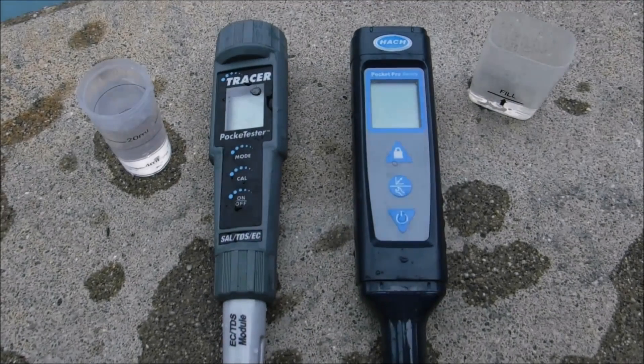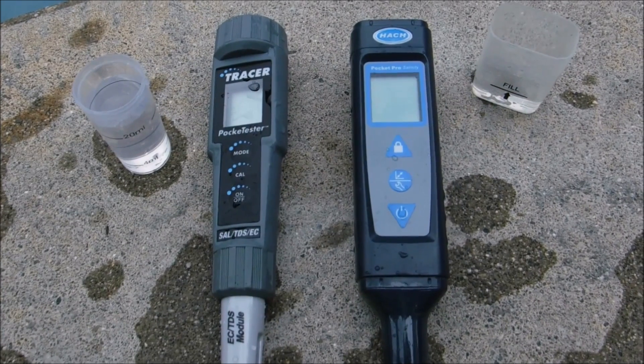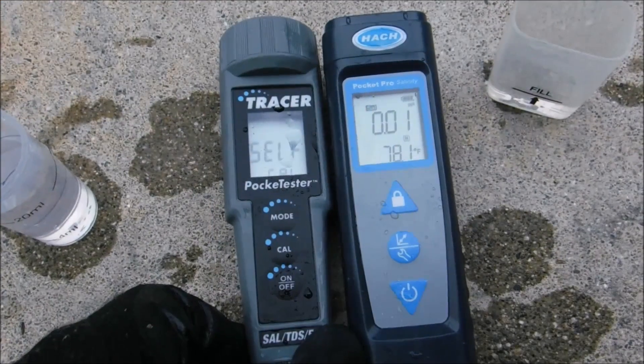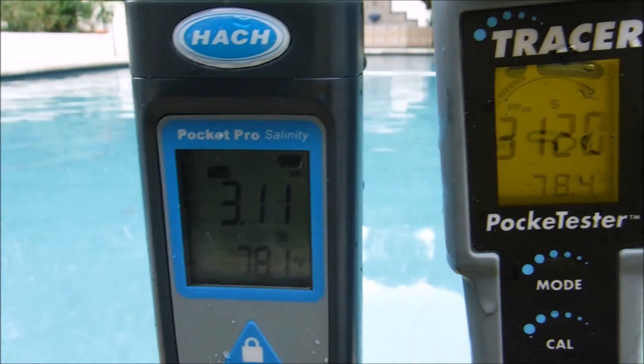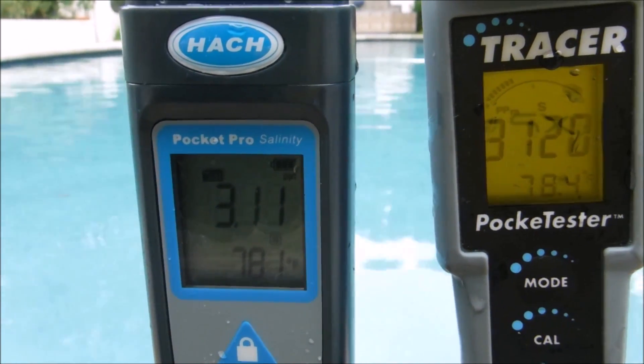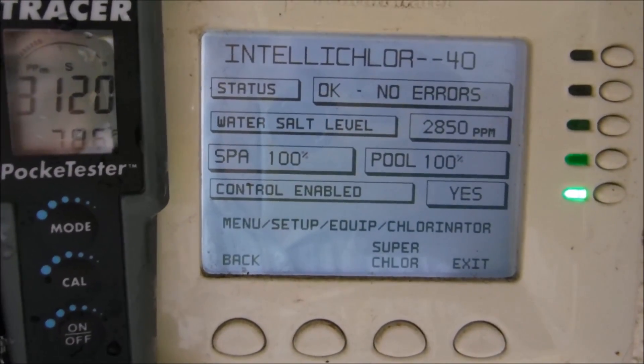I'm going to get the salt level at this pool with two different digital testers — the Tracer by LaMotte and the Pocket Pro by Hach — and let's see if these samples match up. Both meters are reading 3100 parts per million for the salt level in this pool. The IntelliChlor is showing the salt level at 2850.